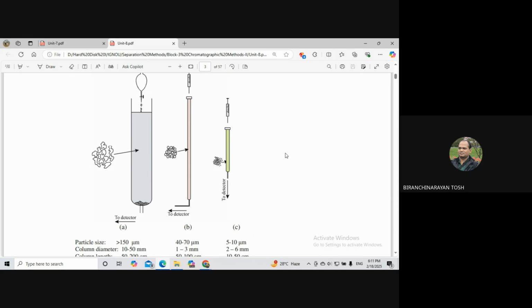According to another version, HPLC may be considered as partition chromatography, where the stationary phase is a second liquid coated on an inert surface and it is immiscible with the liquid mobile phase. According to the stationary liquid phase, the technique may be subdivided into two types: liquid-liquid and liquid bonded phase chromatography. These differ from each other in the way the stationary phase is held on to the support.